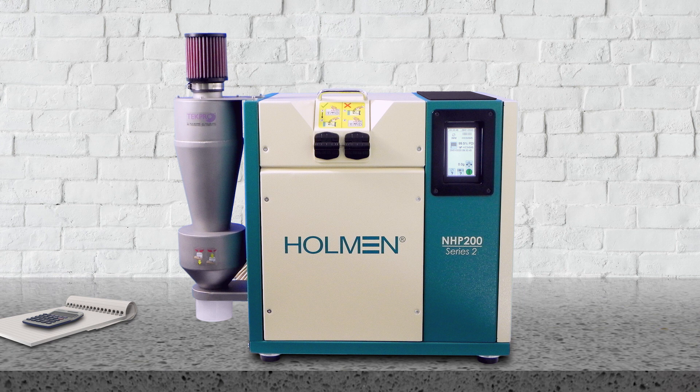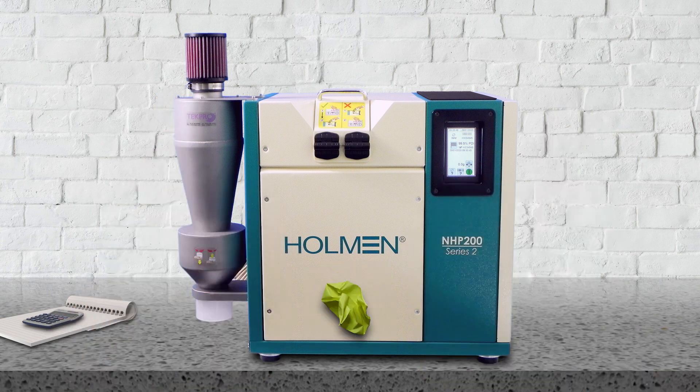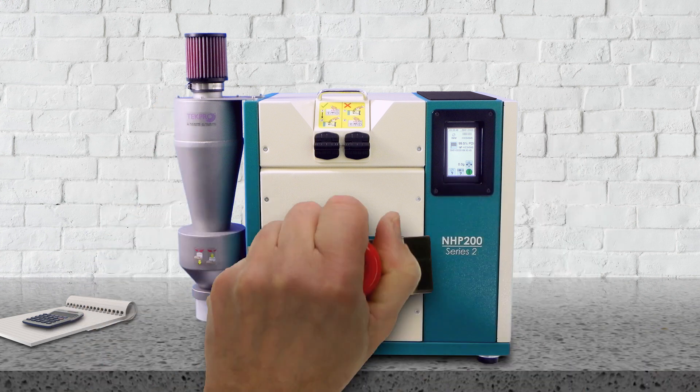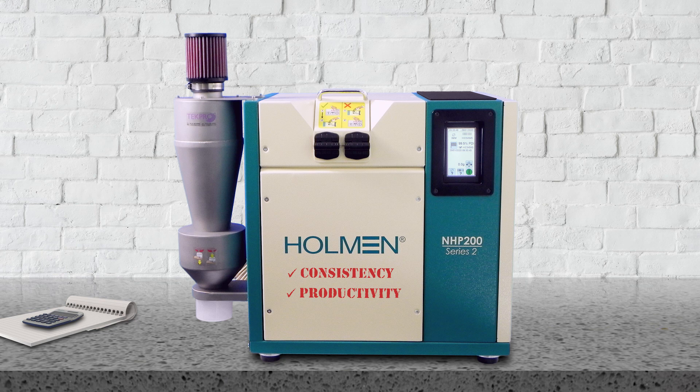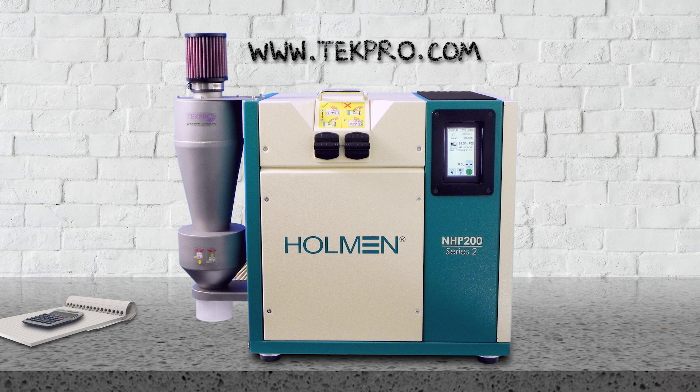So, with the NHP200, you can trust the results and concentrate on adjusting your production variables to maintain quality, and help your staff improve pellet consistency, productivity and your mill's profitability. Get in touch now at www.tekpro.com.